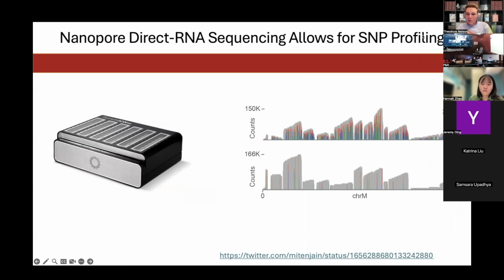And so this actually relates to project I-15. You can basically call these single nucleotide variations within the sequence directly from the RNA data as long as there's coverage in that region. So you're not doing a germline or a genome variation search, but if there's RNA expression at a certain point, you can capture variations at those points and then compare between samples, between species, between people, whatever your comparison groups are for whatever question you want to ask.